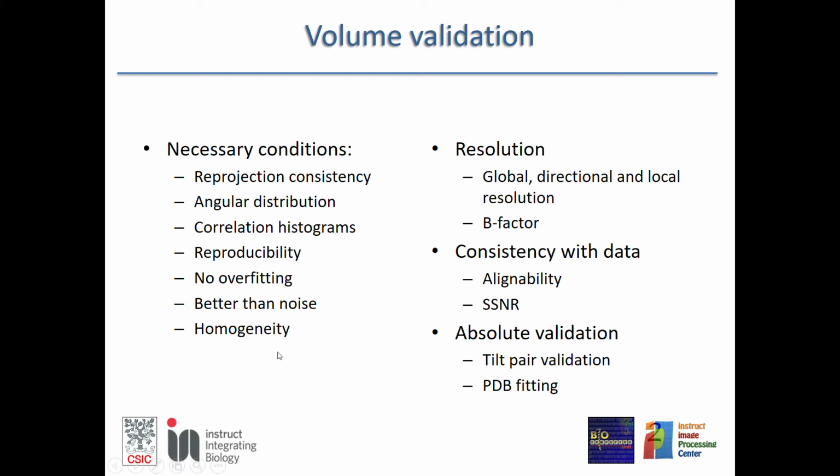These necessary conditions, we will see each one of the individual items, refer to consistency with the data, consistency between each other, and then there are some other validation tools that refer to resolution, to more consistency with the data, and there is an absolute validation in terms of the hand of the volume, and ultimately the comparison to an atomic model, if this is possible because you have high resolution, then that will give you the proof that your volume is correct.